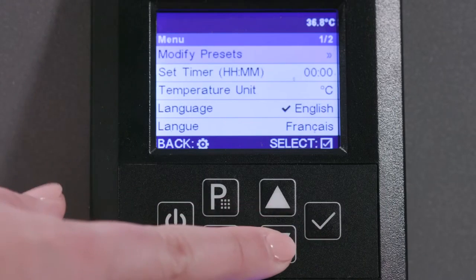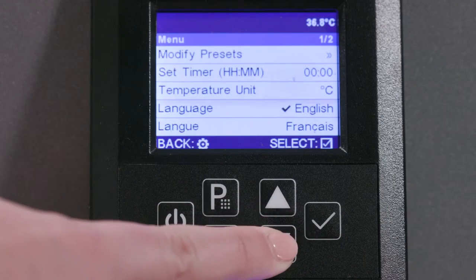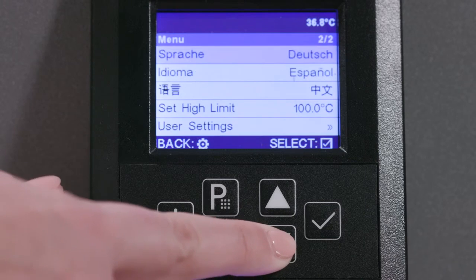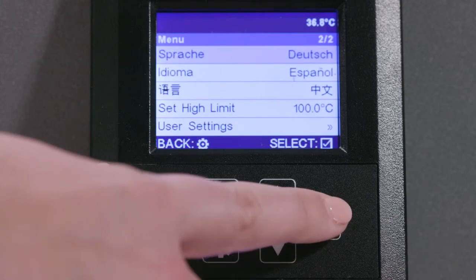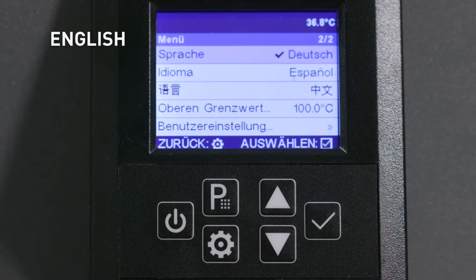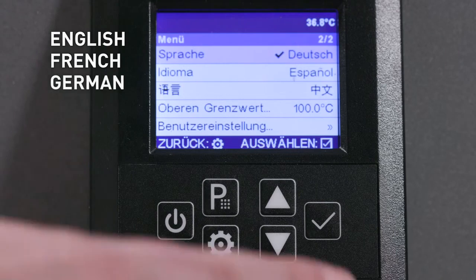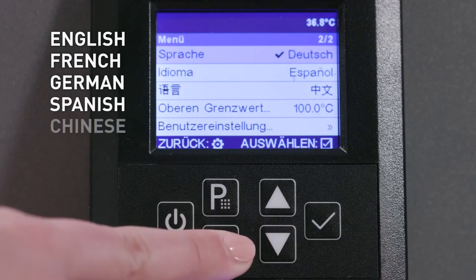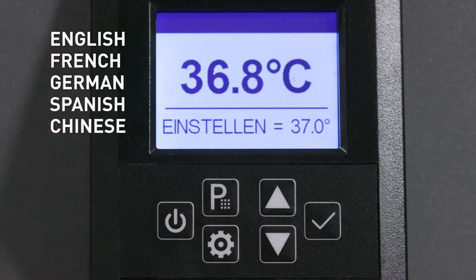The intuitive user interface offers five selectable languages: English, French, German, Spanish, or Chinese.